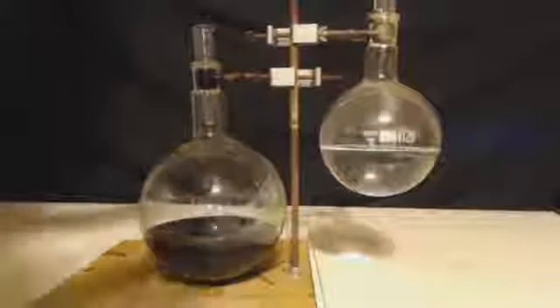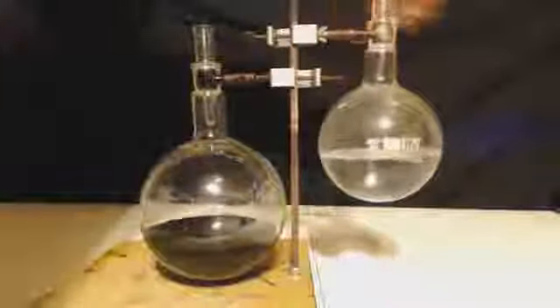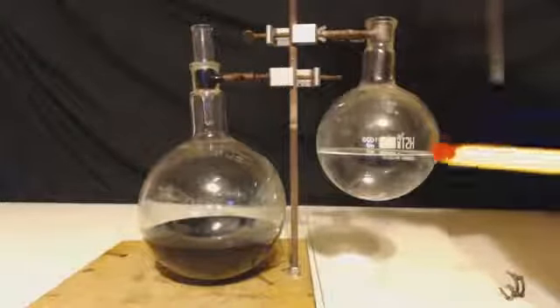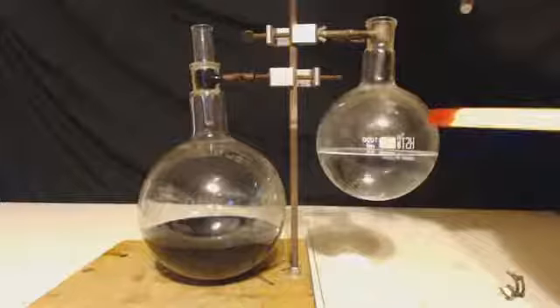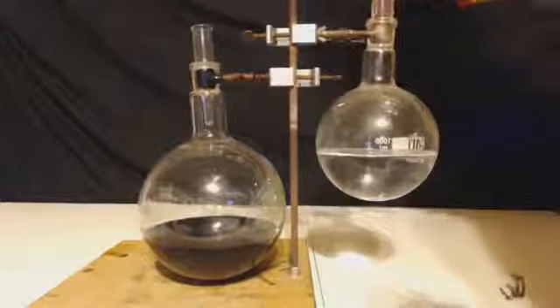On the right is the dilute HCl I boiled off. That's basically the extra water I put in. I wish I wouldn't have put that in. I had to clean all that up. And on the left is what I would have if I didn't put all that water in there. You can see it has a pH of 1 or lower, but it's probably real dilute.